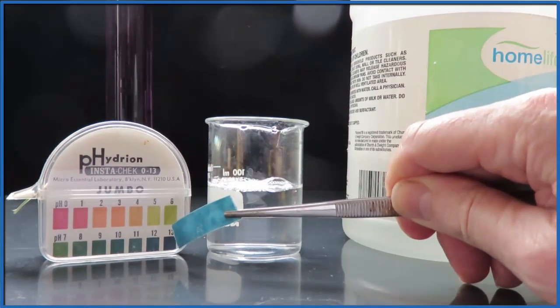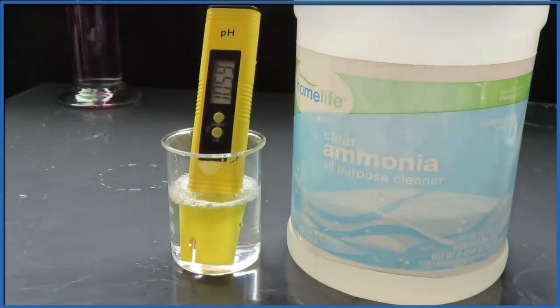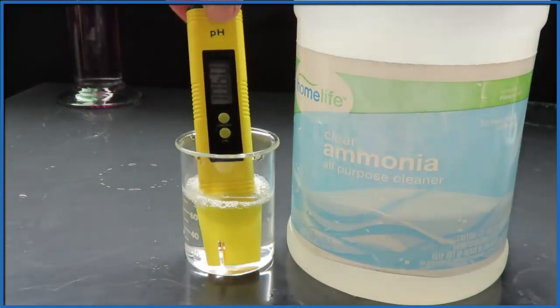We put our pH meter in the ammonia and it reads 10.6, so right between 10 and 11. That's the pH for household ammonia.